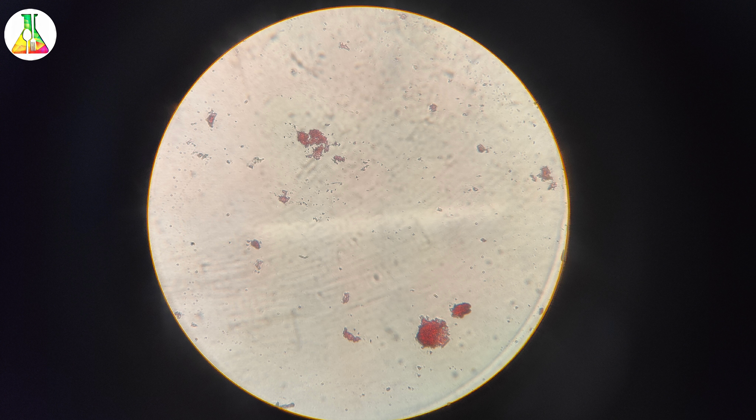After this we will heat fix our slide, following the sterilization of the loop, keeping it a little above the flame this way. See, it is done.